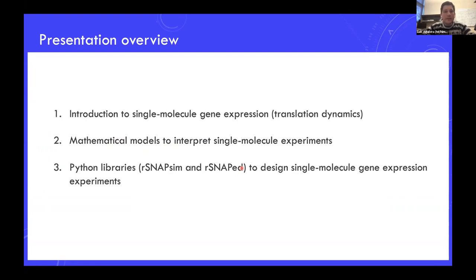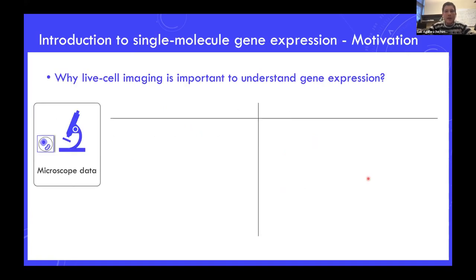So I'm going to start by giving you an introduction about single molecule gene expression with a focus on translation dynamics, a little bit of mathematical models to interpret single molecule experiments, and some Python libraries that we have been working on to design single molecule gene expression experiments. A little bit of motivation.